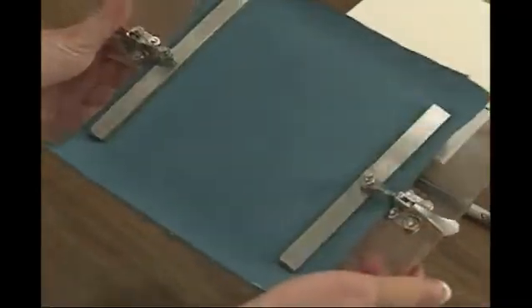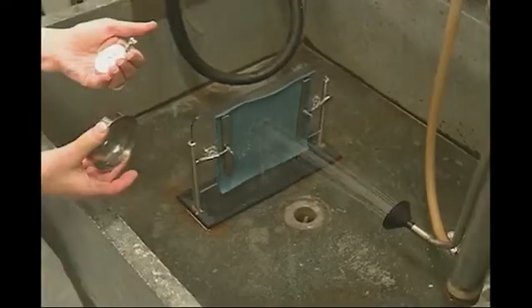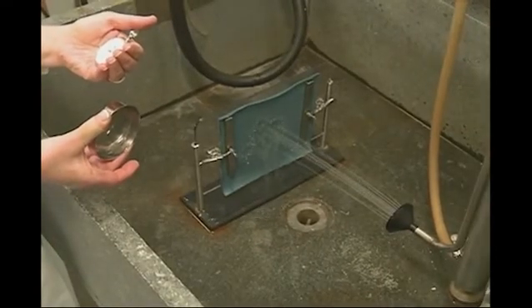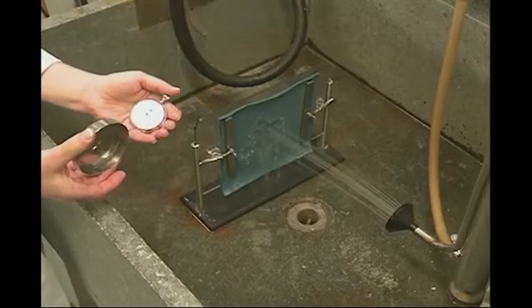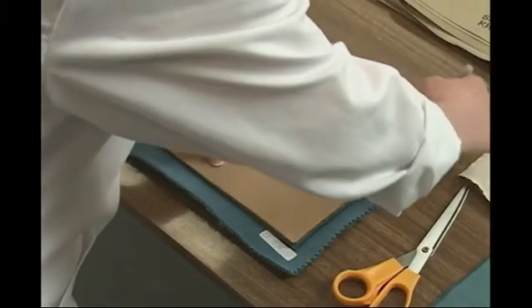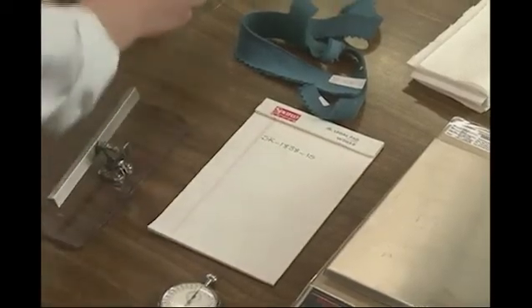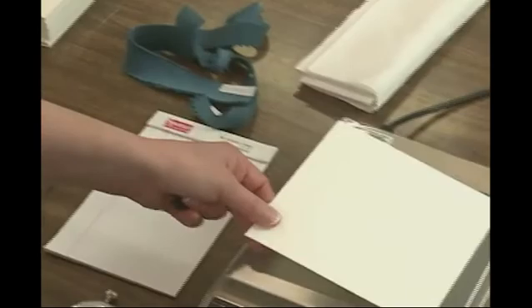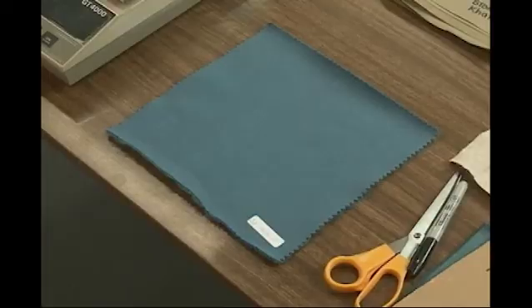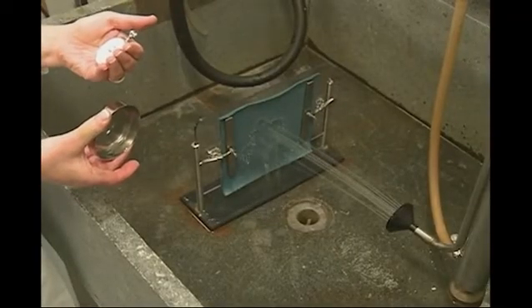The rain test specimen, backed with a weighed blotting paper specimen, is mounted in a holder that is positioned in a vertical alignment. The spray nozzle is pointed at the center of the specimen at a distance of 30.5 centimeters for the duration of the five-minute test, and the water is sprayed horizontally. Three 20 by 20 centimeter specimens are used for the rain test. Each specimen is backed with a 13.2 by 13.2 centimeter standard blotting paper specimen that has been weighed. Fabric and blotting paper specimens are to be exposed to standard atmospheres for conditioning before testing. The layered specimen is then clamped into a holder and placed in a mounting device in the basin of the rain tester.